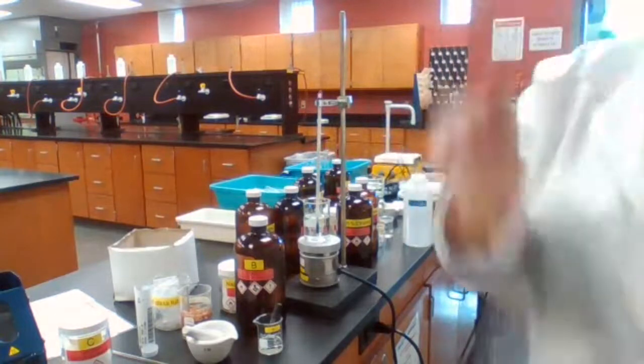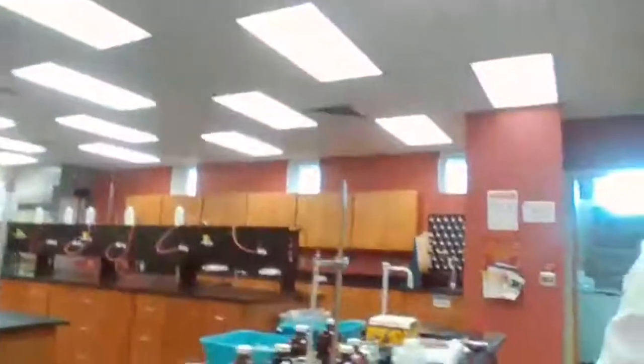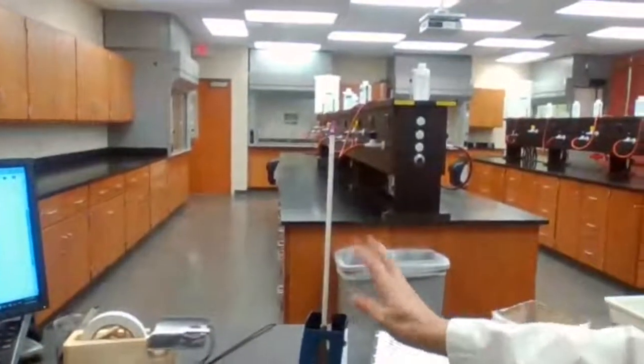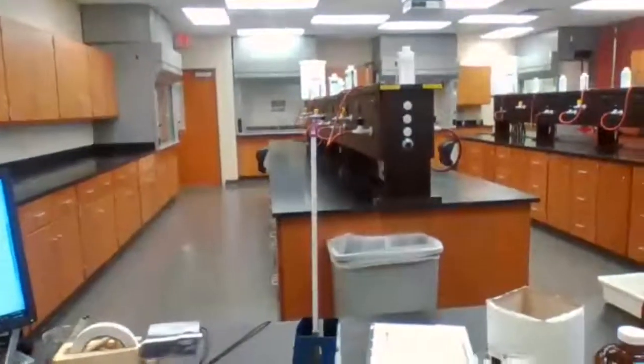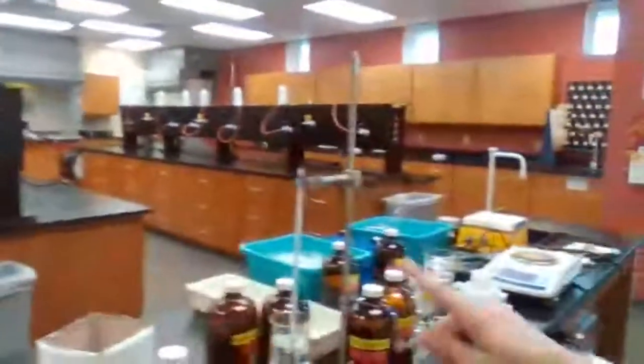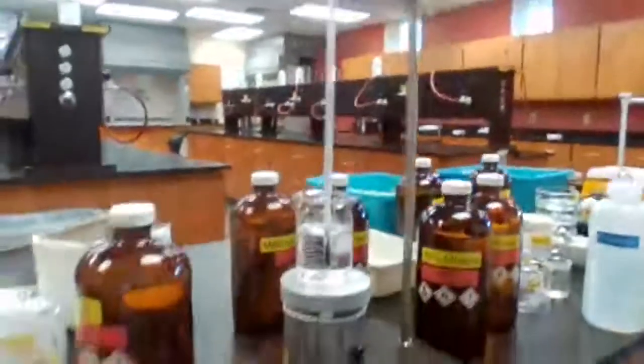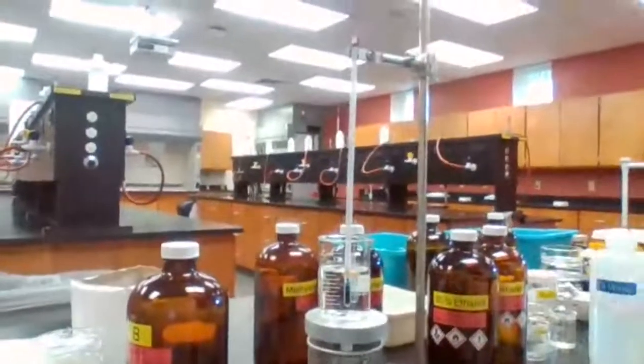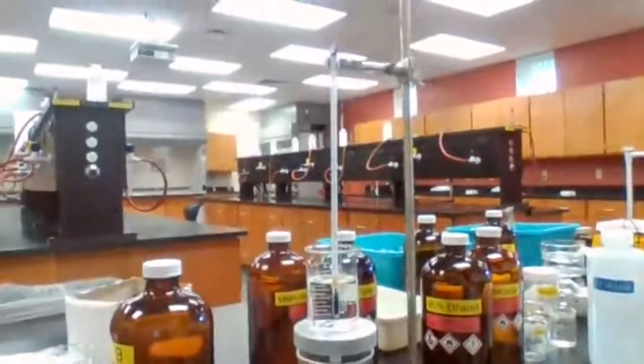The thermometer temperature is at 40 right now. Okay, thank you for your responses. Yes, this is not 70 yet. That's why it just reached 70 right now. So I'm going to finish this experiment for boiling first, and then we go to the melting. It's good to take advantage of the time we have.